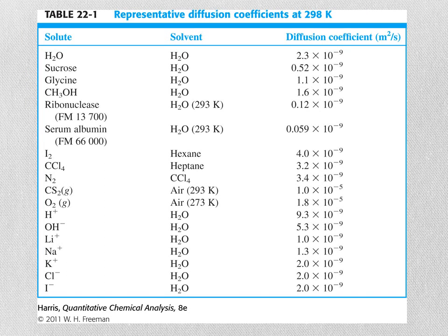Here you have a number of diffusion coefficients for liquids, where you have different solutes in different solvents. Mainly, this is stuff in water, and you can see that the diffusion coefficients are really quite small.